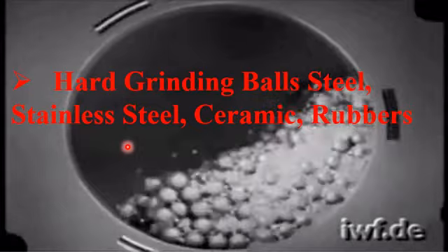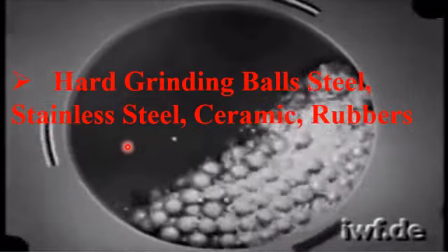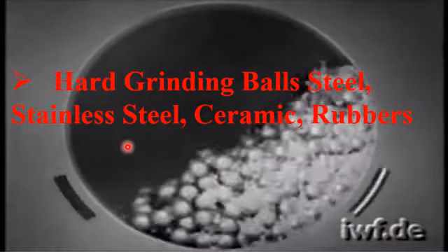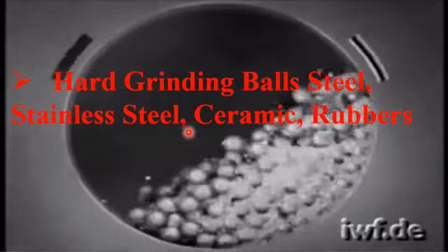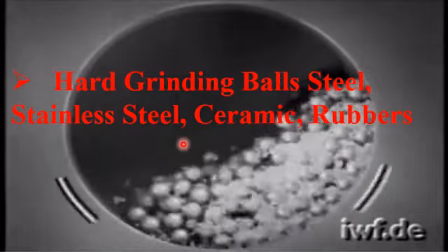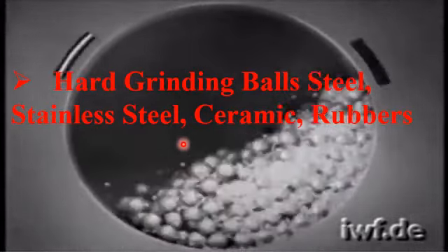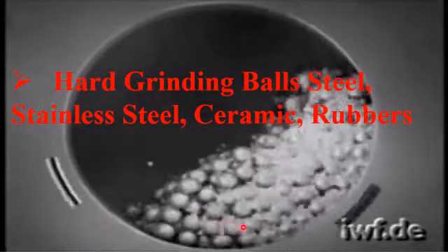On these drive shafts, a pulley and belt are used to transmit the rotary motion. So the small ball mill setups are based on pulley and belt, which transmit the rotation of those grinding balls.